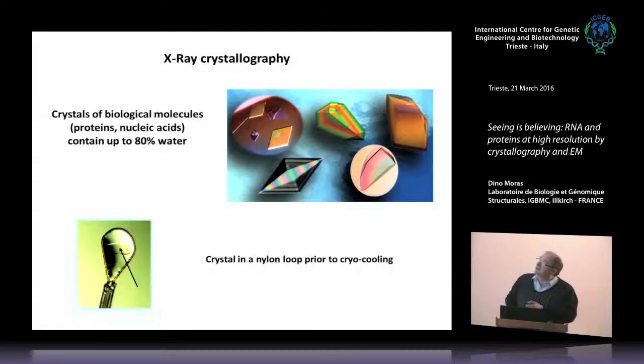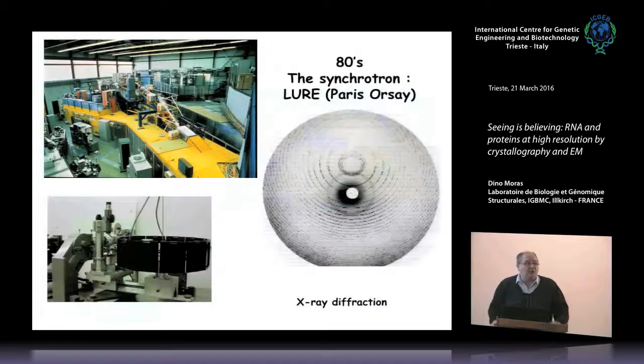Crystallography itself is with crystals. And don't forget that crystals contain up to 80 and sometimes more percent of water. That is their concentrated solution structure. One tends to forget, it's not solid state. It's frozen state. And don't forget, because what we are looking at with other methods, like cryo-EM, is also frozen state. The only difference is that the crystals are ordered, and so you use that for diffraction.